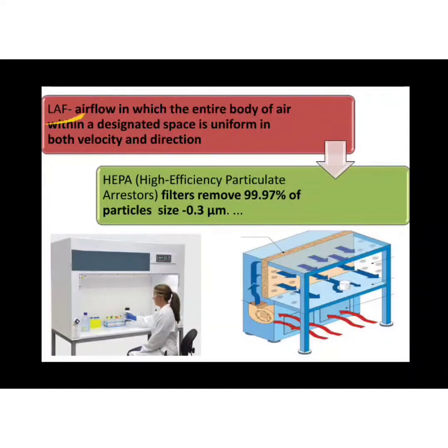As I told, this is an instrument used to sterilize or filter out the air. It is generally used for inoculation purposes. If I want to transfer any medium, pour a medium, transfer an organism, or do inoculation, in all such instances I will use this laminar airflow bench, which is a closed cabinet. There will be a glass door. It has three switches: one for the light, another for the UV lamp, and the third for the blower.